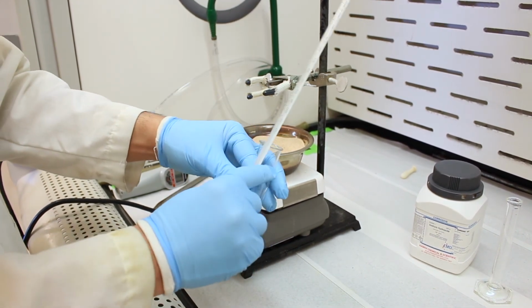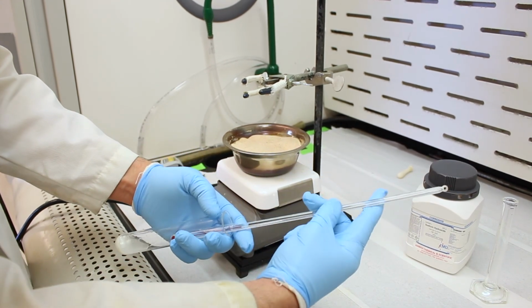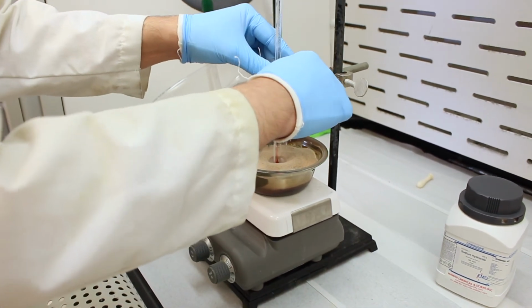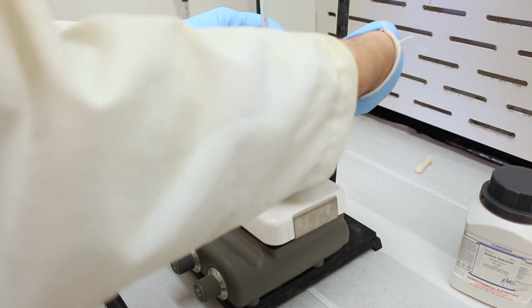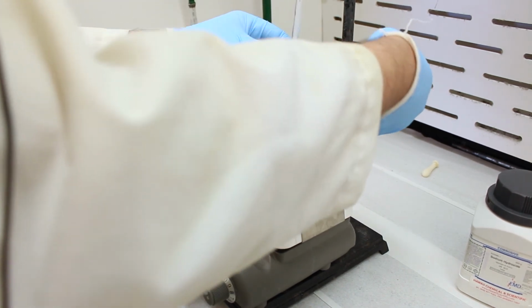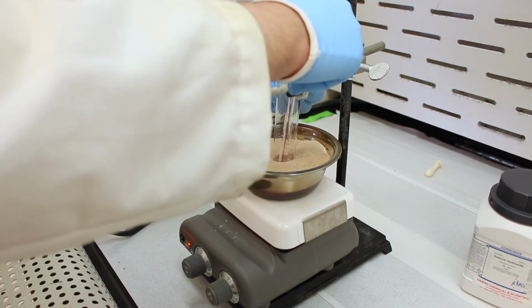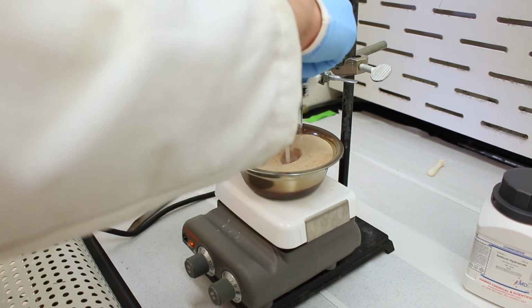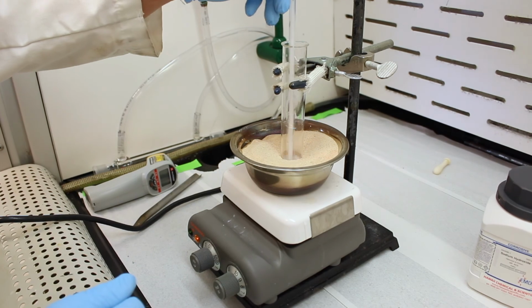So here's the tricky part. We have to slide the thermometer into the tube without it coming loose. Okay, there we go, and now we can put it into the reaction. Now the goal here is to keep the temperature of the solution between 160 and 170 degrees Celsius for at least 5 minutes. So that looks good. Clamp it in place here. Make sure this test tube is hitting the bottom. Okay. And now we're going to agitate for 5 minutes.